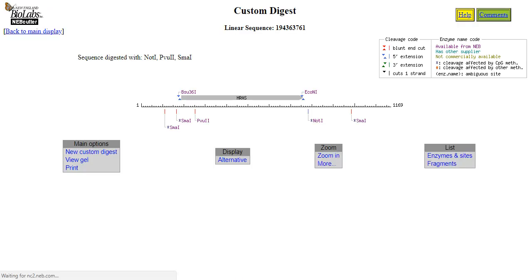Okay, so I'm going to digest that. All right, now this one's interesting. What will happen is you'll see up top here that they have some default enzymes that put on either end. Just ignore those unless they're the enzyme you're going to use to cut. All right, unless it's on our choice that you're allowed to draw from. Okay. So I'd actually have to make my map now of this, so I'm going to kind of cheat and do a screenshot.